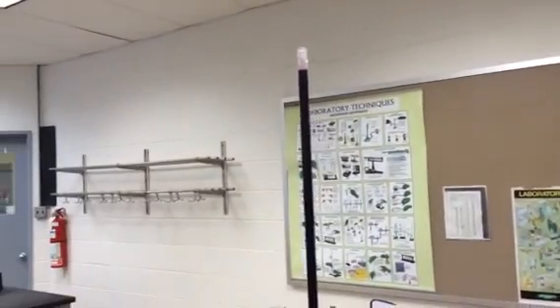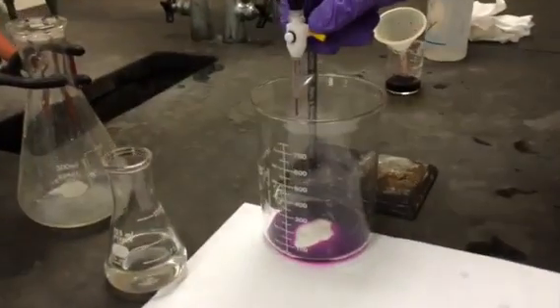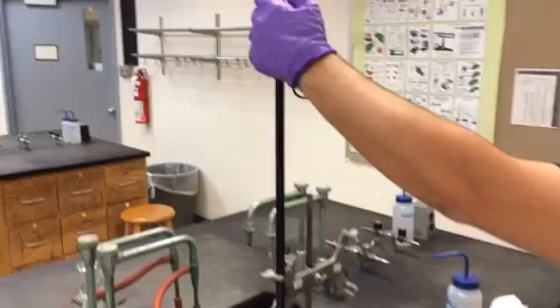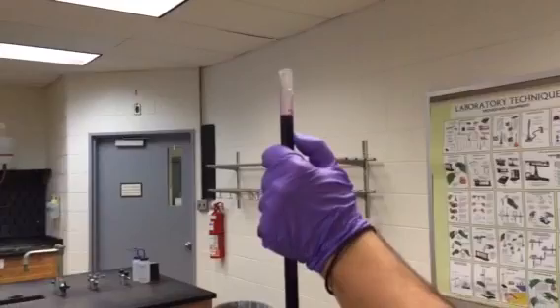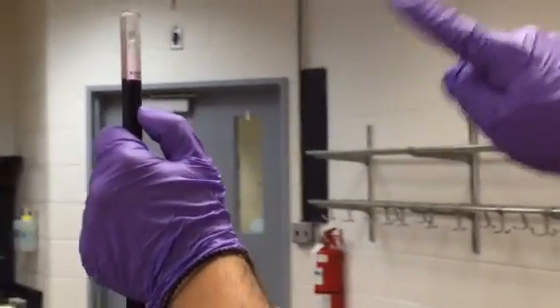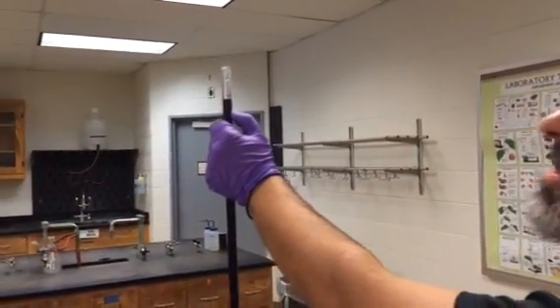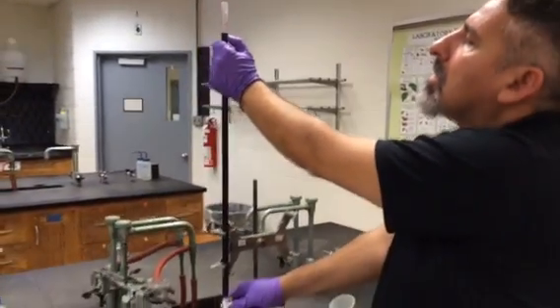Make sure the permanganate doesn't go on your clothes — if it does, it will never come out. There's a gap here so I open the stopcock to fill the tip. Now I look at the top. At this point my zero is here — I need to come lower to read it. This is a colored solution, so we are not looking at the bottom of the meniscus but at the top of the meniscus.